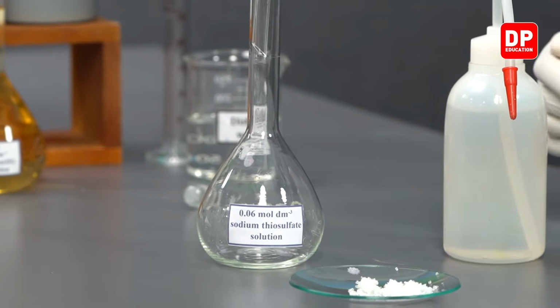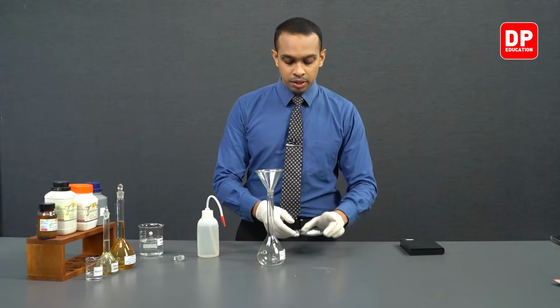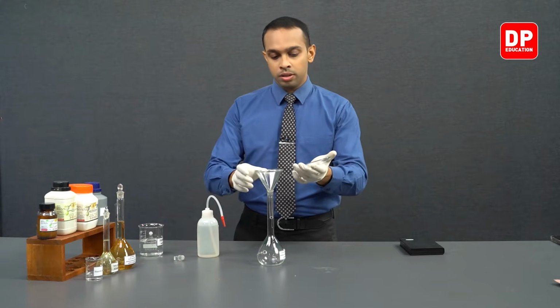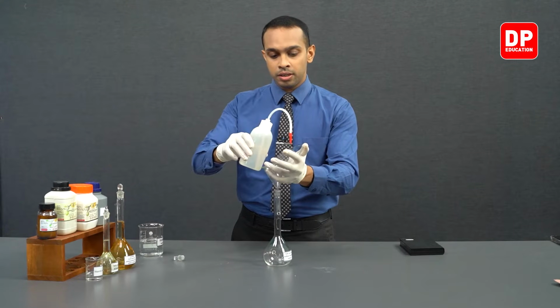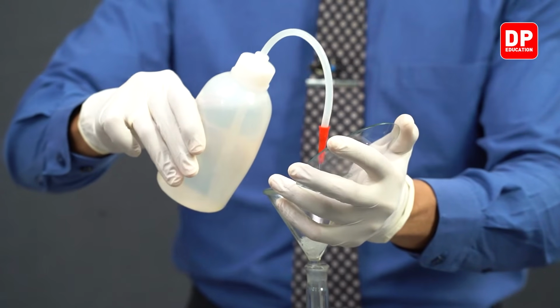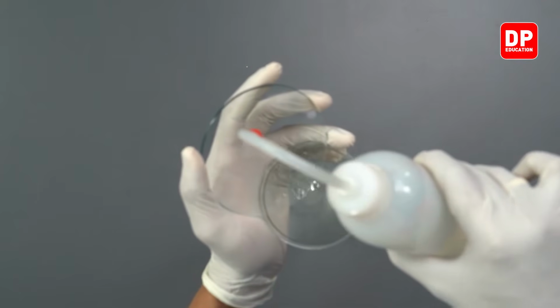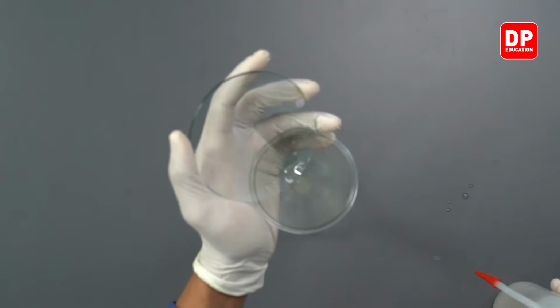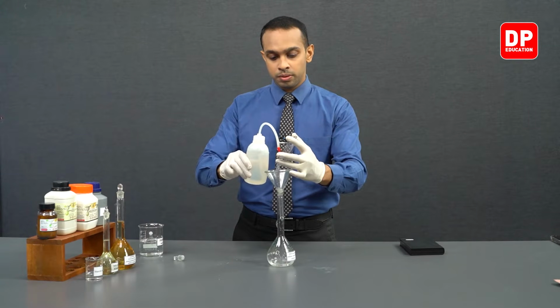Now we are going to transfer this solid with the use of a wash bottle this way. We have learnt about transferring solids in the following manner in previous experiments. We need to wash the watch glass after transferring the solid like so.